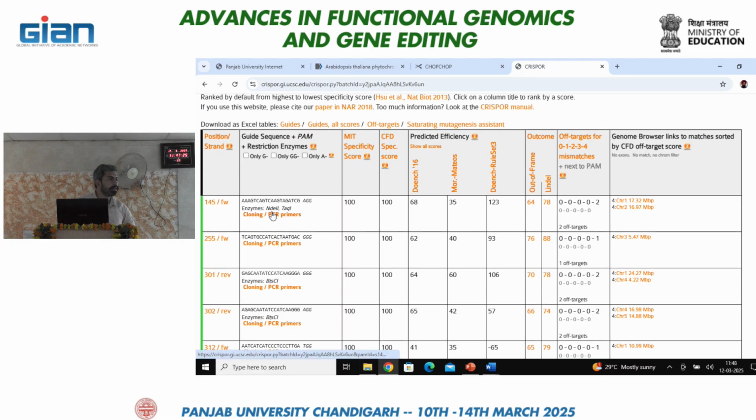For example, if we are using BSA1 restriction sites for designing the construct, and if the same sites are available in this target region, that will be a problem. Suppose any other sites. Basically, I just made an example.